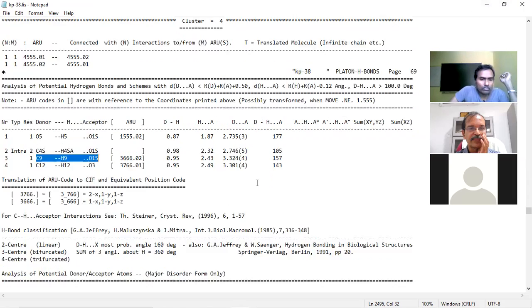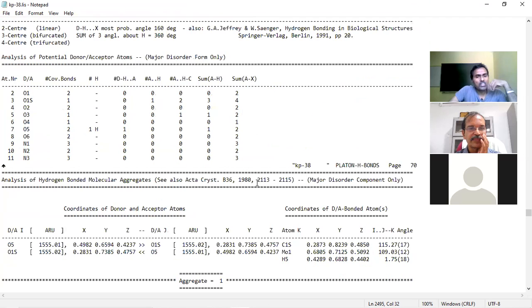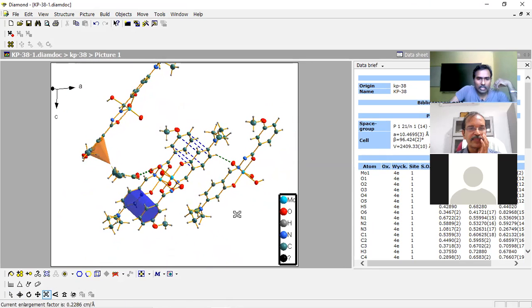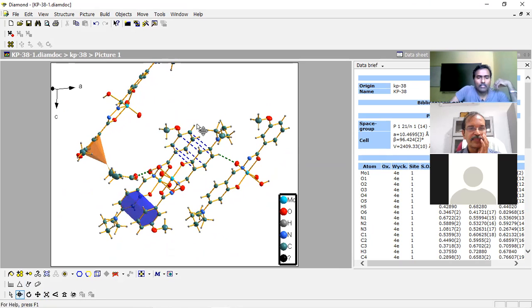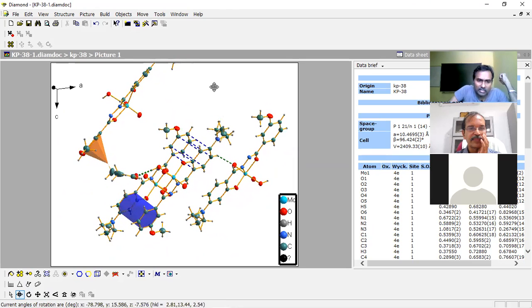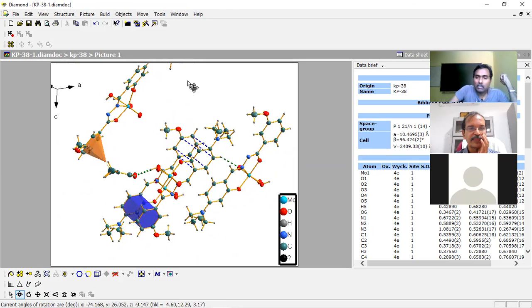So these are the ways to find out and draw these hydrogen bond interactions and all these other interactions. Then we can clearly rotate this after drawing everything. Then we have to find a suitable position where you can easily see all interactions and label it. So all hydrogen bond interactions, pi-pi interactions, CH-pi interactions must be visible very clearly. So we have to rotate and see the exact position where you can clearly see all these interactions that you have drawn, and then label it.